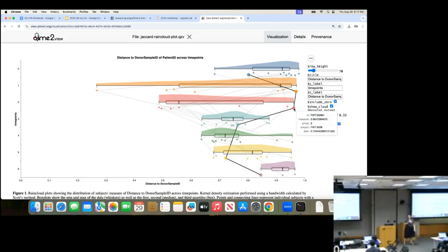And so, I always love to see that big jump, but it doesn't necessarily mean anything to me until I see some stability in that, which we do see, right? We have that big jump and we see some stability in it. That makes me really happy. And I would consider that a sign of high engraftment, but again, there are many factors in engraftment extent.